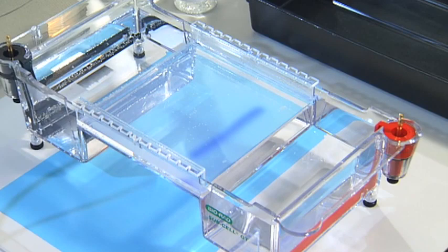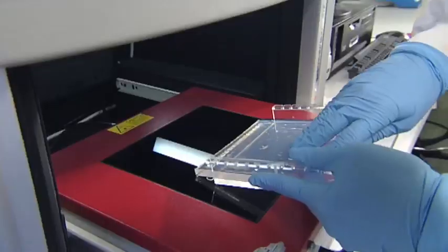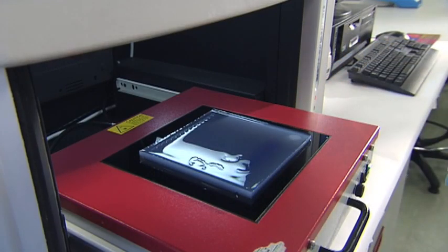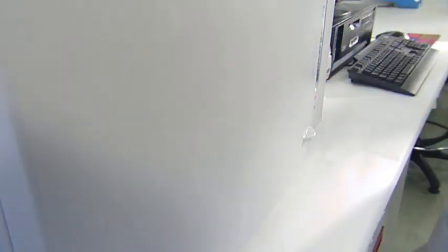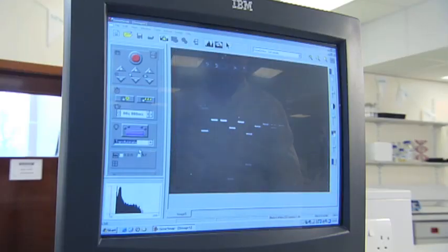Once the fragments have separated sufficiently, it's time to visualise them. In order to have a permanent record of the fragment separation on the gel, you need to take a photograph. This is done by placing the gel on a UV illuminator inside a box which also contains a camera. The illuminator is switched on and the gel image is displayed on a computer screen. The image can then be saved as a digital file or printed out.